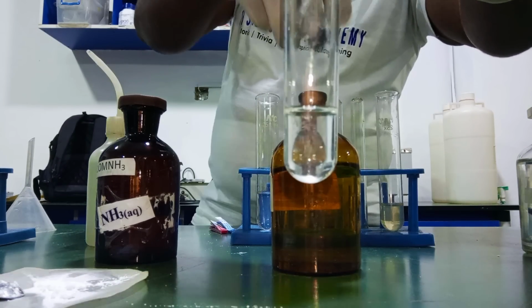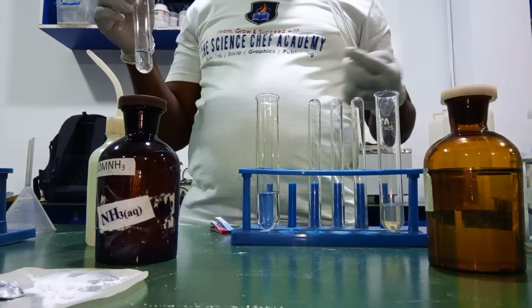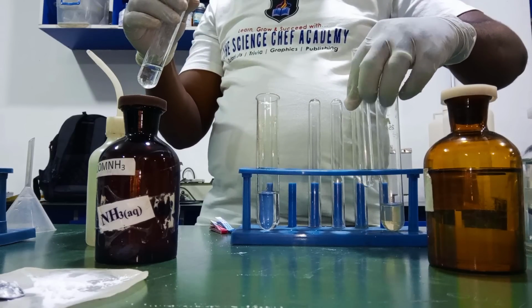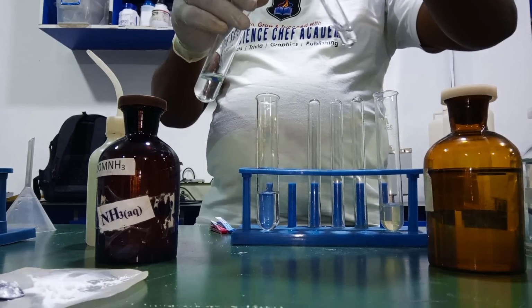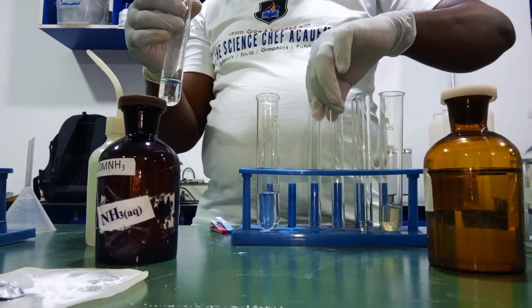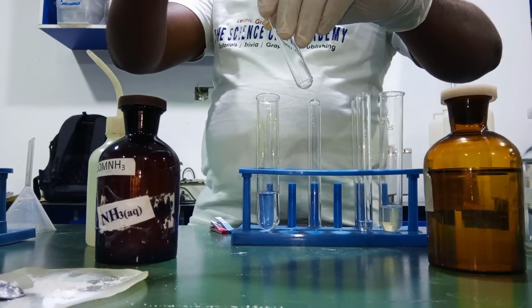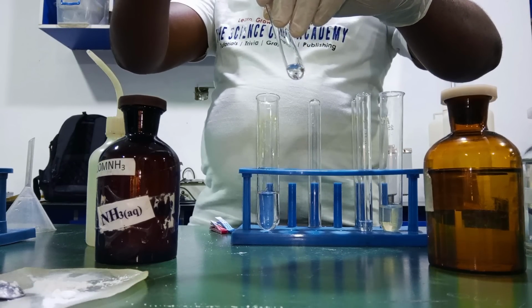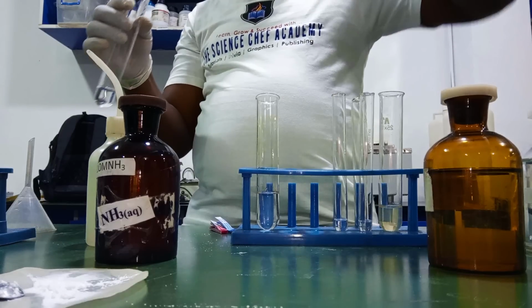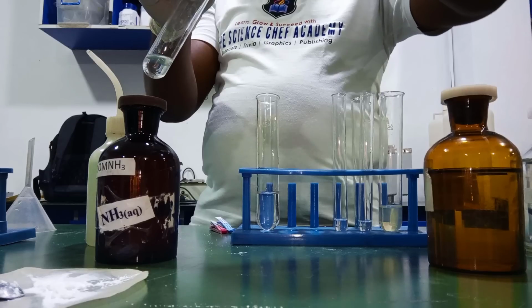Good. So from here now we're going to divide this solution into three portions. The first portion, second portion, and the third portion.